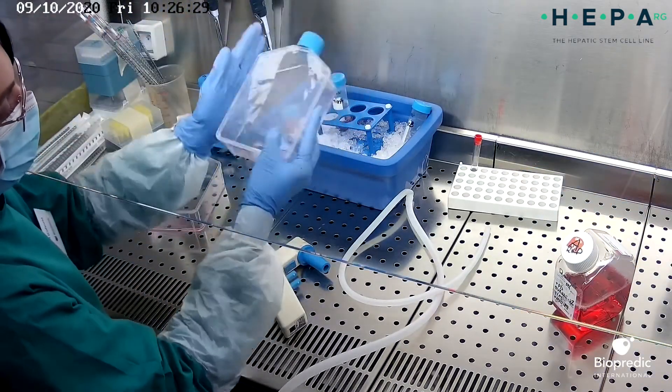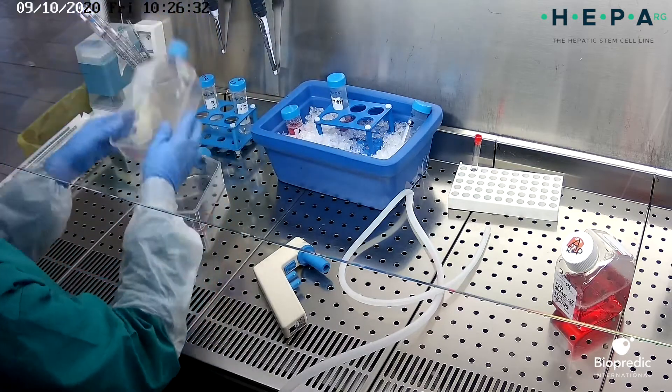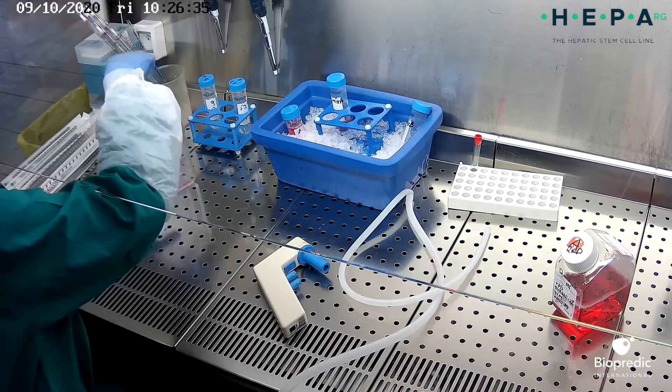Then check the cell detachment under the microscope. You may need to tap gently on the flask to help cell detachment.